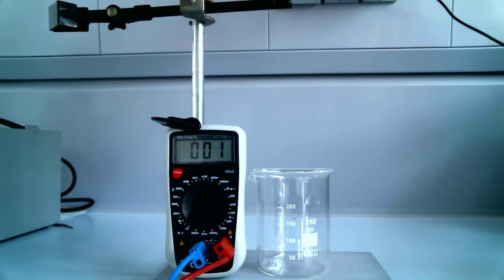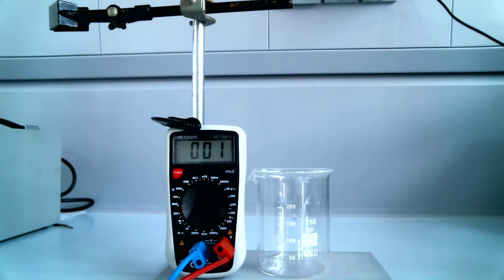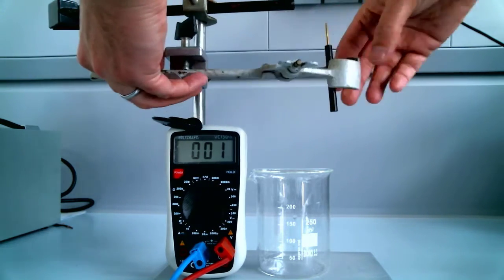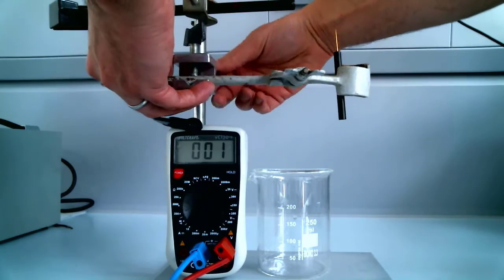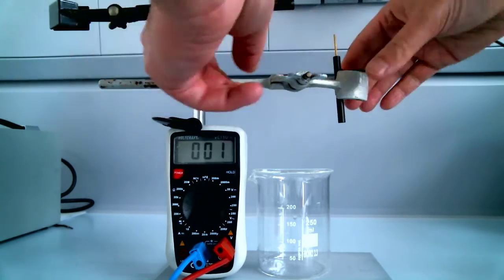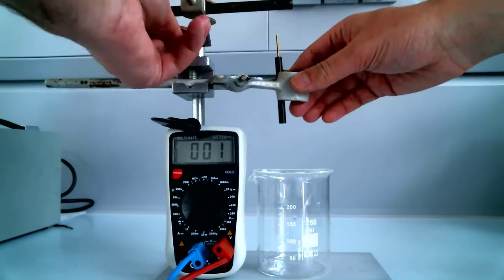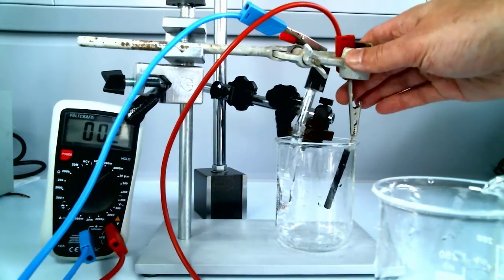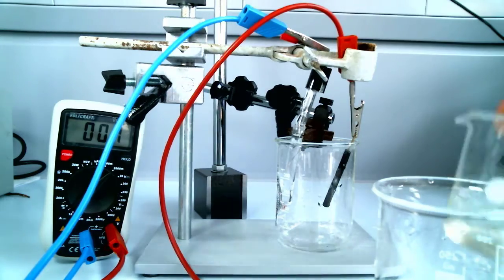The reference is silver with silver chloride on the surface, and it will react, so it will either turn into more silver chloride or the silver chloride will turn back into silver, which gives us our reference measurement. We're going to then use that in an iron 3, iron 2 coupled solution.